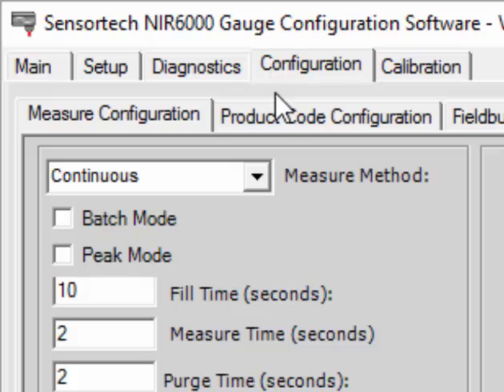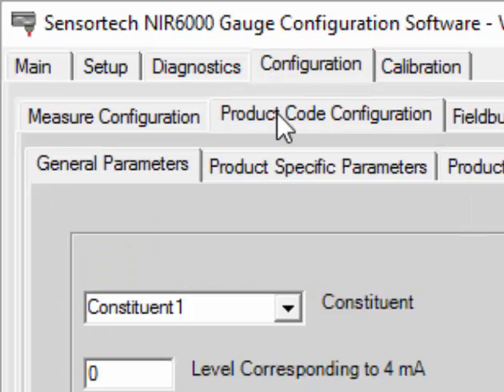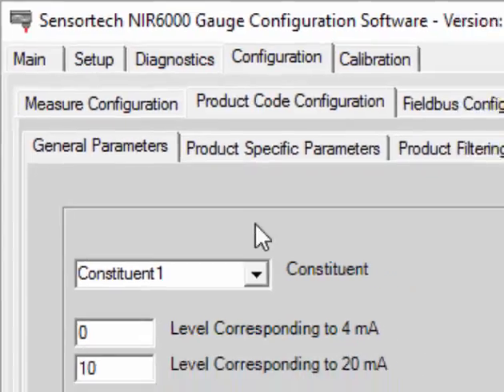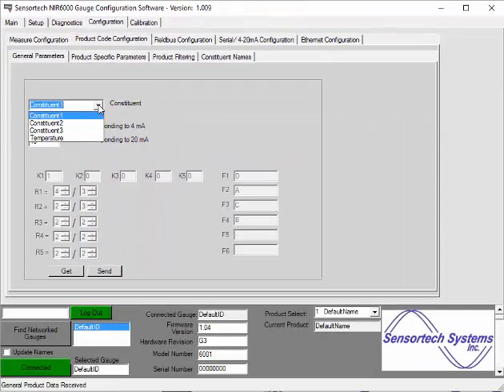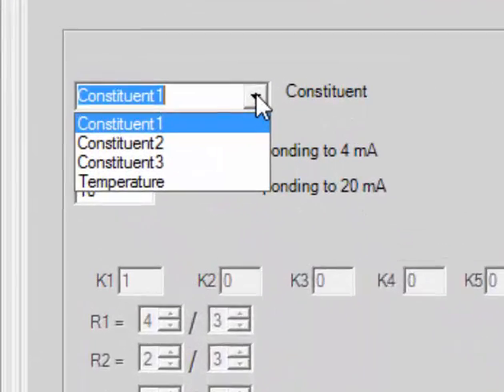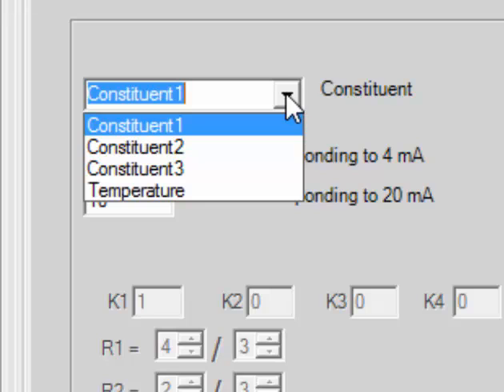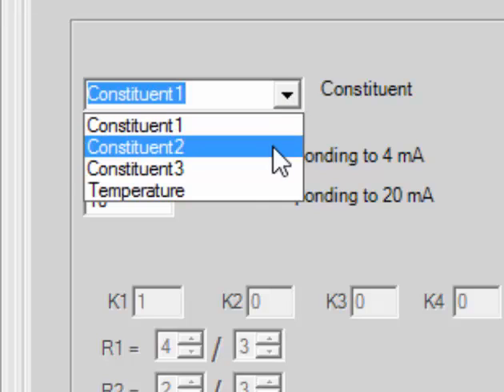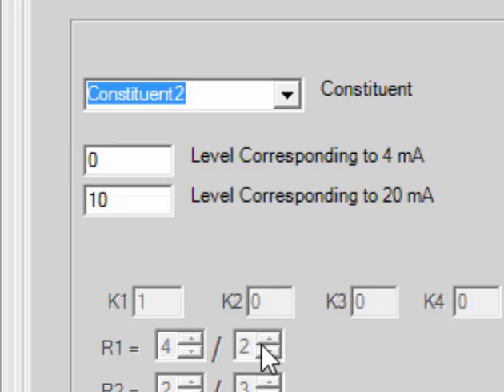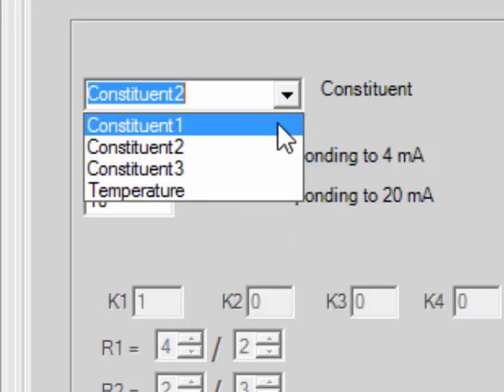Go ahead and select the Configuration tab and navigate to the Product Code Configuration submenu. From here you will see the General Parameters tab and notice a drop-down menu that displays three constituents and a temperature option. This analyzer is configured for two constituents and does not include the temperature measurement option.